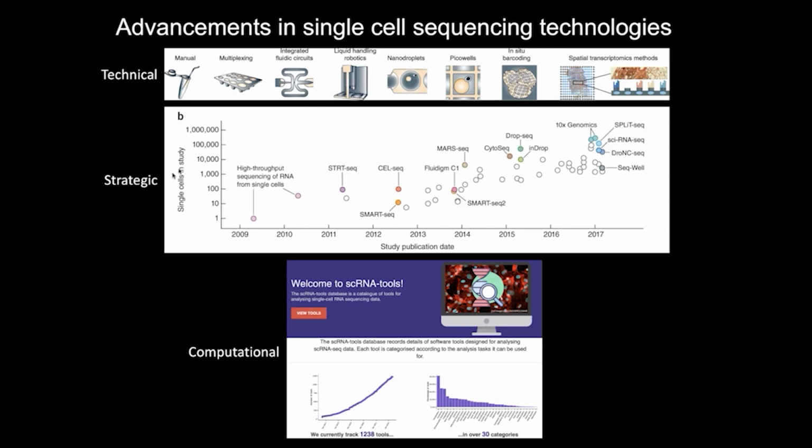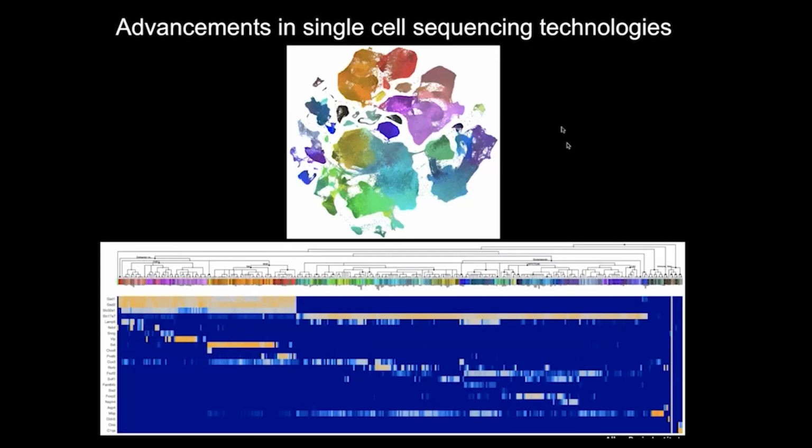So generating this type of data has become much easier over time, but how one assesses this large-scale single-cell data is an ongoing process and continually being improved with a variety of computational tools for bioinformatic analysis. And this is just one example from the Allen Brain Institute, who has done single-cell sequencing of the adult mouse cortex and also the primate and the human.